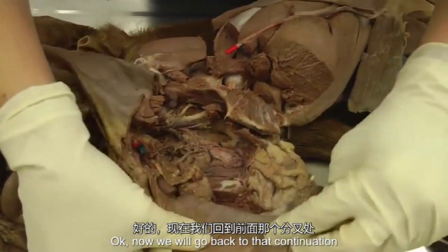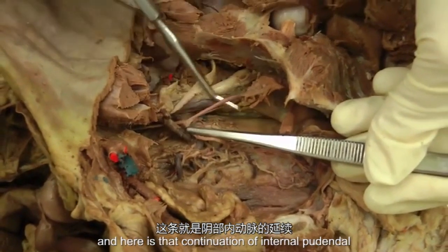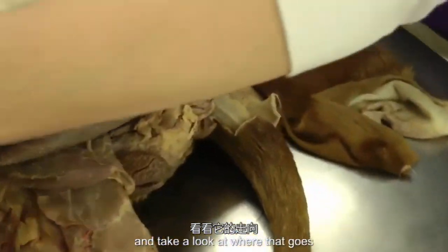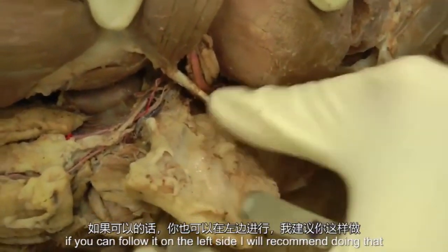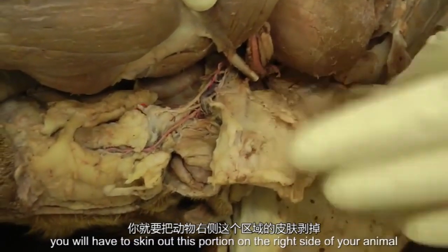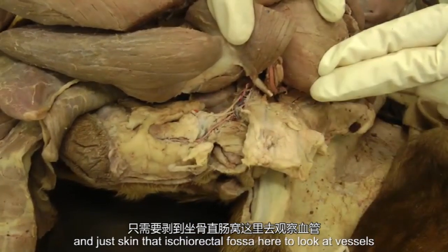Now we'll go back to that continuation. Here was that vaginal coming off, and here is that continuation of the internal pudendal going outside the pelvis. Now we're going to flip the leg and take a look at where that goes. If you can follow it on the left side, I would recommend doing that. If you don't have this visible or they're broken, you'll have to skin out this portion on the right side of your animal and just skin that ischiorectal fossa here to take a look at these vessels.